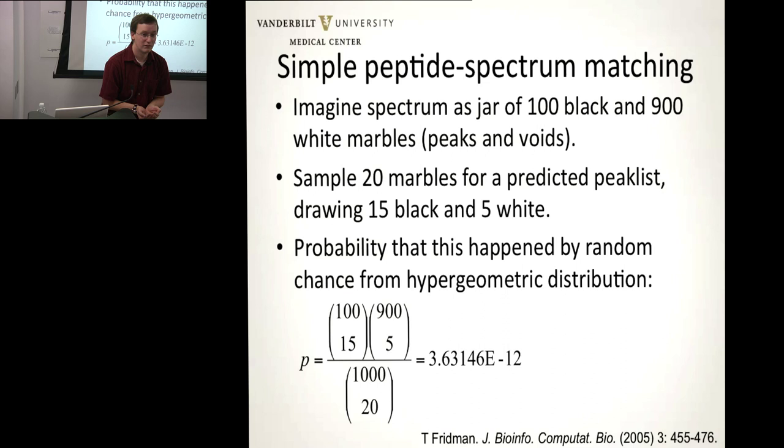All black, absolutely, sure. If my hand is full of black marbles, there are no white marbles, it means that every location where I predicted a peak, I found one. Now that doesn't happen, not in practice. Maybe for a very, very simple toy spectrum or something.